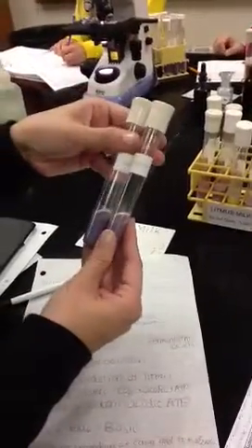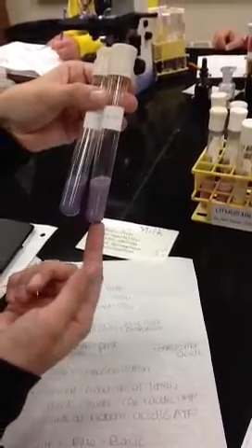Here's the litmus milk test. With something like this, you have the control, which is obviously the purple right here. And then we have the S-Aureus. And so although they look the same, we do have a color change here. So you're going to look for more pink or more purple or more blue, and you're going to draw your conclusions from there.